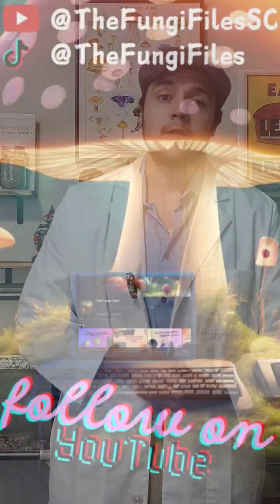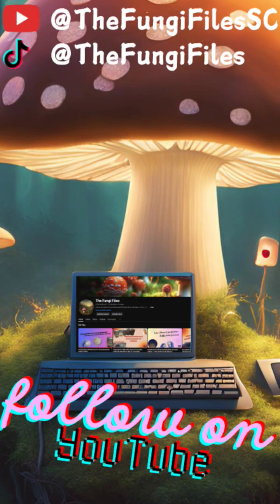We will be checking on the previously inoculated agar dishes to see if the liquid culture for the cordyceps militaris is contaminated or not. Thank you all very much for joining us.